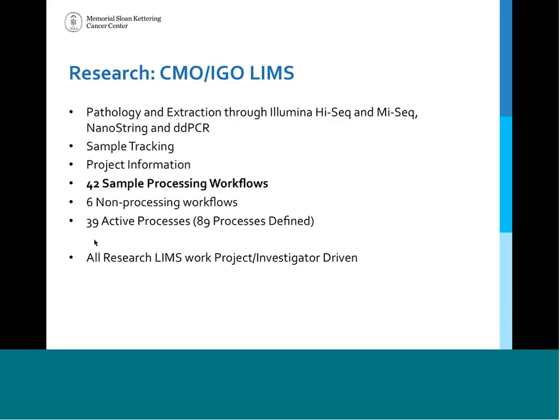So to give you a little snapshot of what we currently have in our research LIMS, we have pathology workflows and extraction workflows all the way through to Illumina sequencing and MiSeq workflow. We have workflows to handle NanoString and digital PCR. Our primary aim is sample tracking and project information, but we have a number of different things to interact with the LIMS to get information that we've recorded back out.